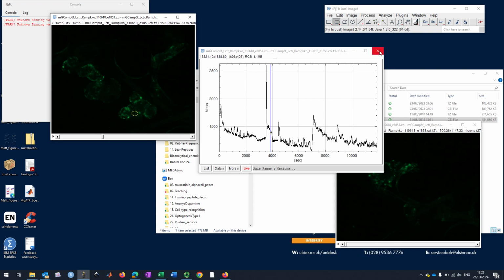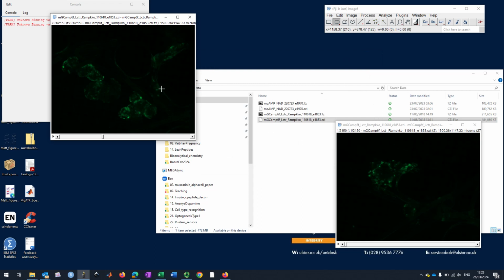Before we dip into analysis, we probably need to do two things. We definitely need to do two things. We may want to correct for motion a little bit, firstly, and secondly, we would want to automatize the data acquisition. The reason is that obviously I could drag this region of interest, this little ellipse, all around and collect these curves from each point in the image, but it will take me a whole day doing that. So we need to do this more automatically.